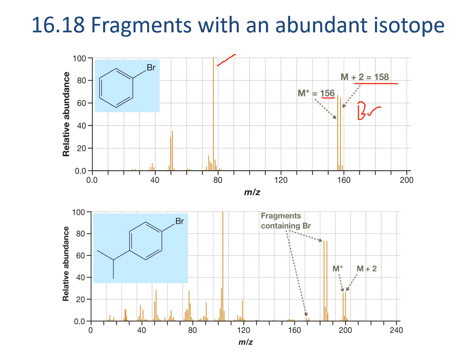Notice we actually also have another peak over here. It's fairly common for us to be able to strip off halogen and leave behind the other radical, particularly if it's an aromatic radical. And so our base peak actually comes from the aromatic itself. Notice that we have 6 carbons, so 6 times 12 would be 72. And we have 5 hydrogens on here, so we'd say 72 plus 5 equals 77. And our base peak is just this aromatic without the bromine and having a positive charge there.